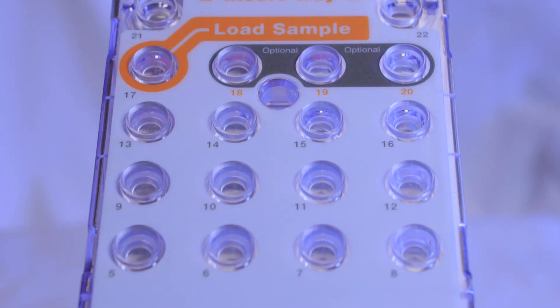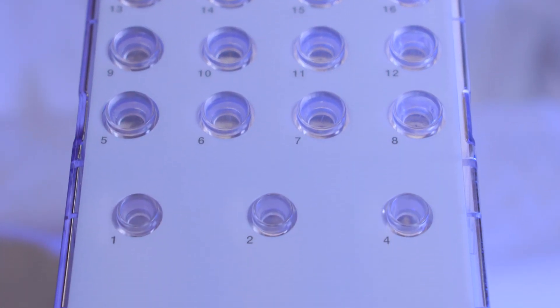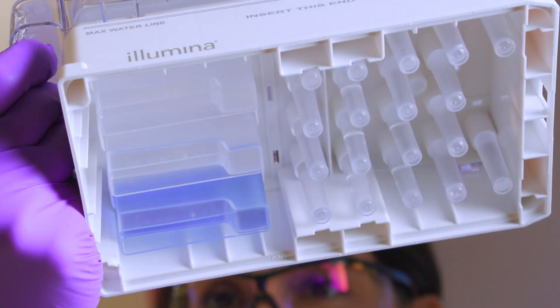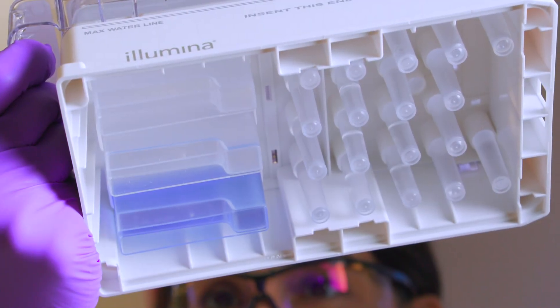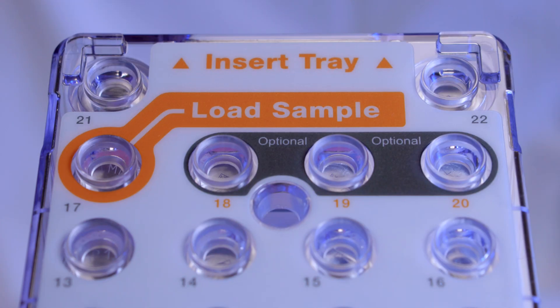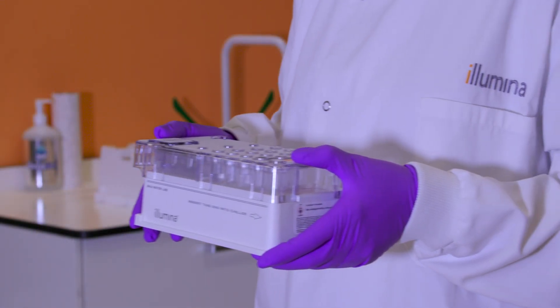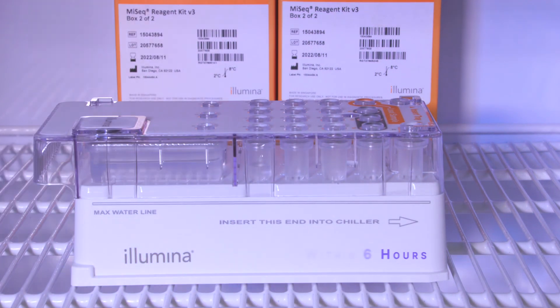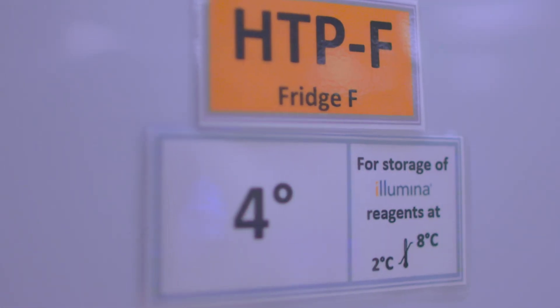The MiSeq sipper tubes go to the bottom of each reservoir to aspirate the reagents, so it is important that the reservoirs are free of air bubbles. For best results, proceed directly to loading the sample and setting up the run. Alternatively, set the reagent cartridge aside at 2 degrees to 8 degrees Celsius.